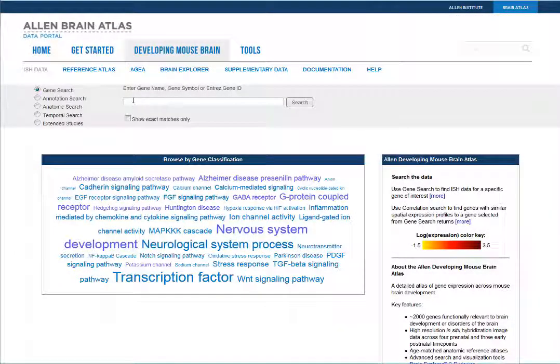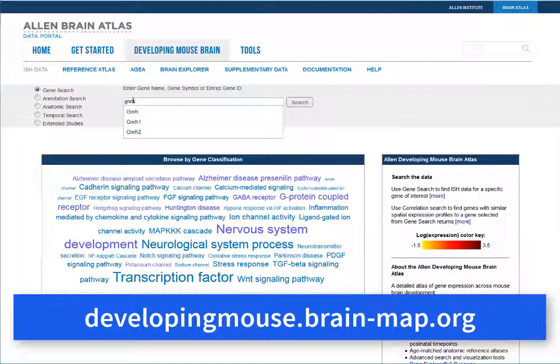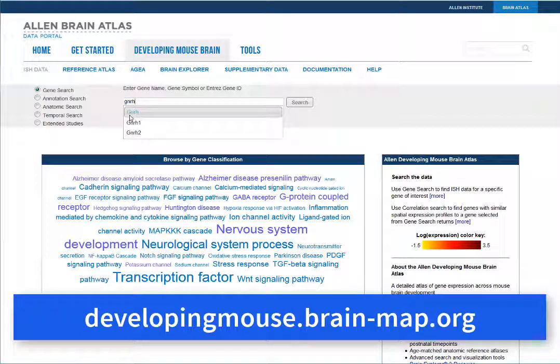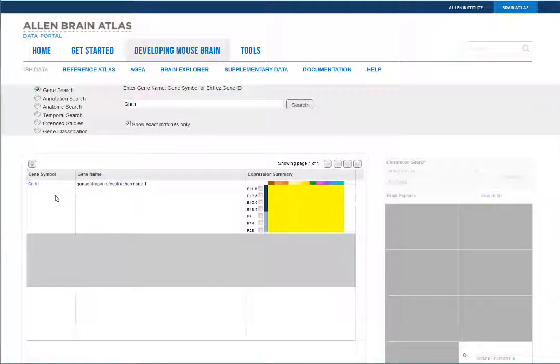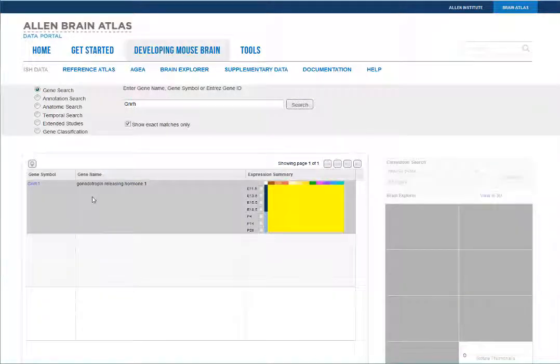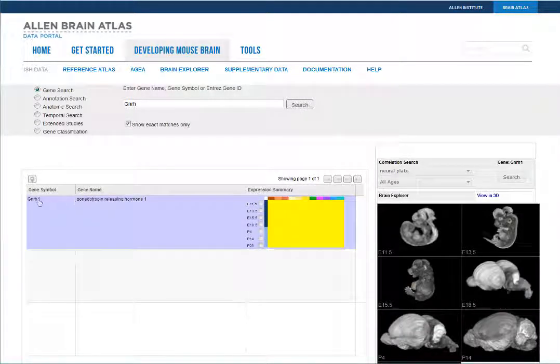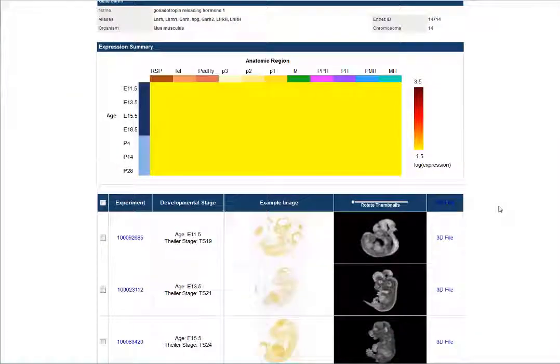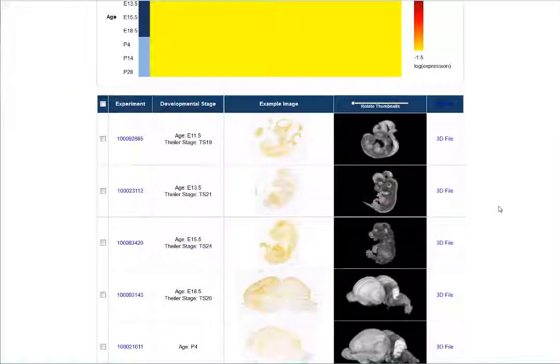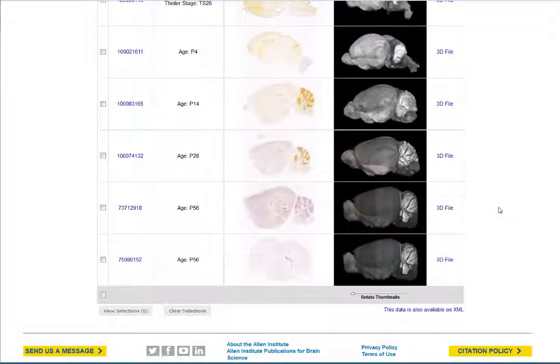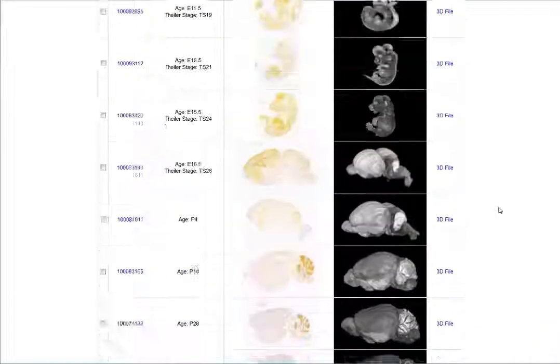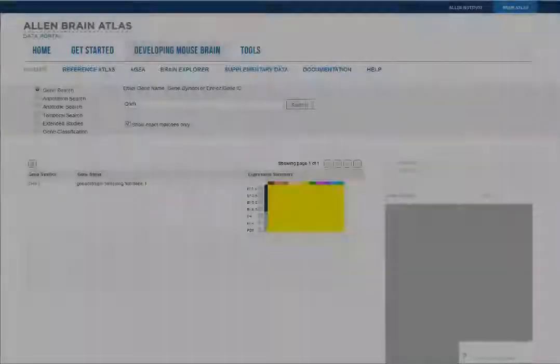The developing mouse brain atlas has very similar tools and to demonstrate looking at multiple experiments simultaneously, we'll use this atlas. Clicking the gene symbol brings up a gene page showing many experiments. From that page or the search returns page, you can click on the checkboxes next to an experiment to load your cart.